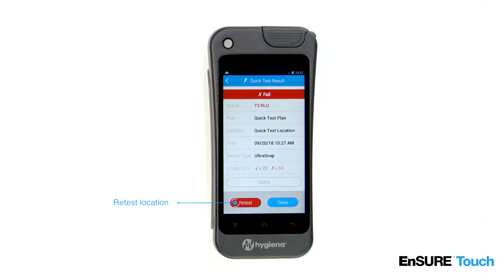When a test does not pass, a corrective action such as re-cleaning should be performed. After, it's important to retest the location and keep a record of the retest result. From the results screen, simply touch the retest button.